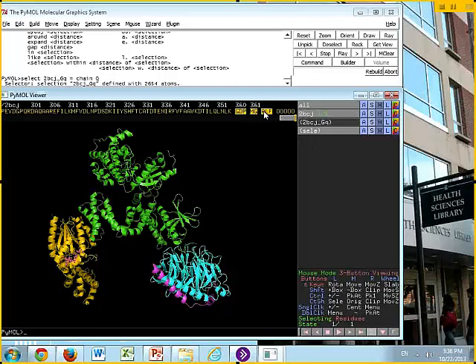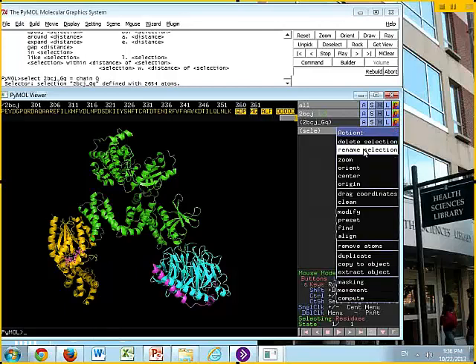Now, if you click on the GDP, what happens? You pull up a generic selection. And then you can click on the magnesium, aluminum fluoride, and the 5 waters. So highlight those 5 molecules into a generic selection. You can either edit a selection that's already there, or if you turn it off so you don't see it highlighted in your sequence viewer, if you start clicking on residues, it goes into a generic selection. Everybody see that? So we now have a selection SELE.